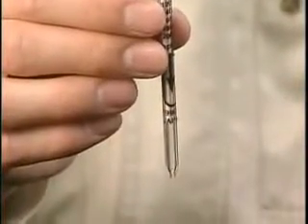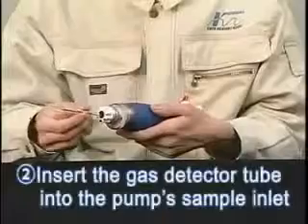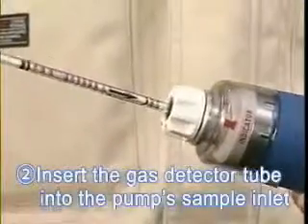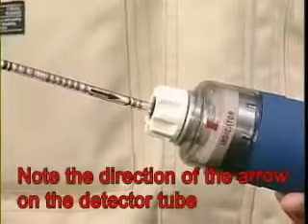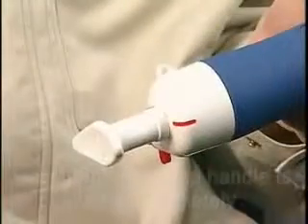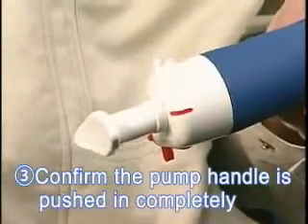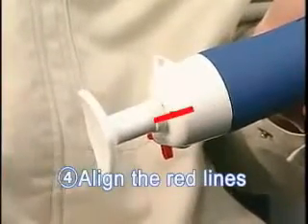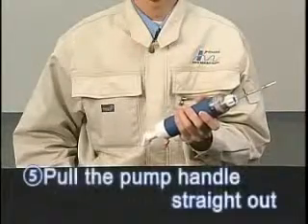After cutting both ends of the detector tube, close the cap to the tip cutter. Insert the detector tube into the pump's sample inlet with the arrow pointing toward the pump. The arrow indicates the direction of the sample gas flow. Push the pump handle to confirm it is pushed in completely. Align the red line on the pump handle with the red line on the pump body. We are now ready to begin sampling.